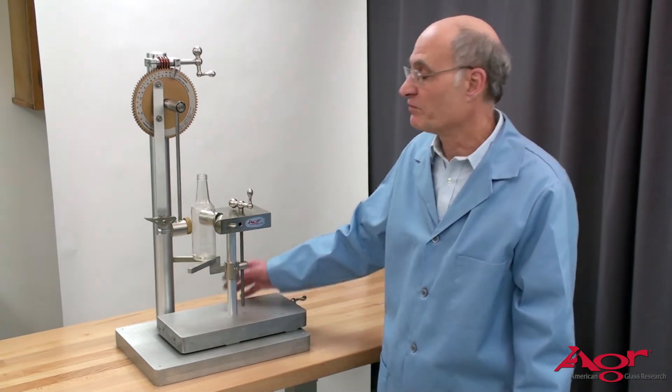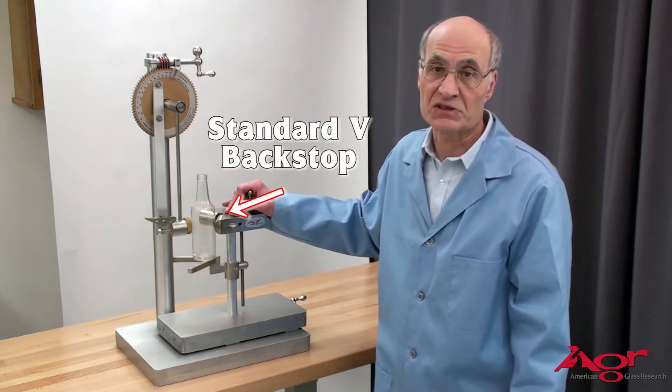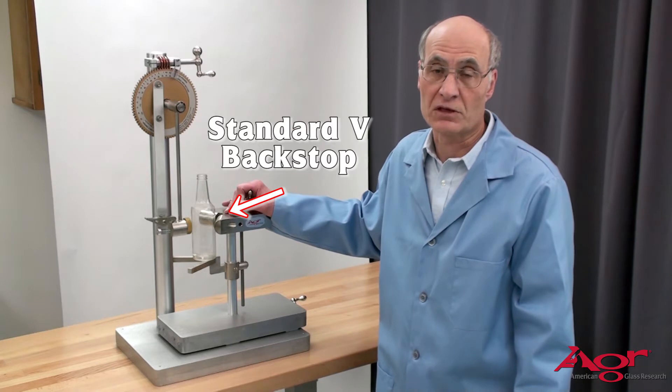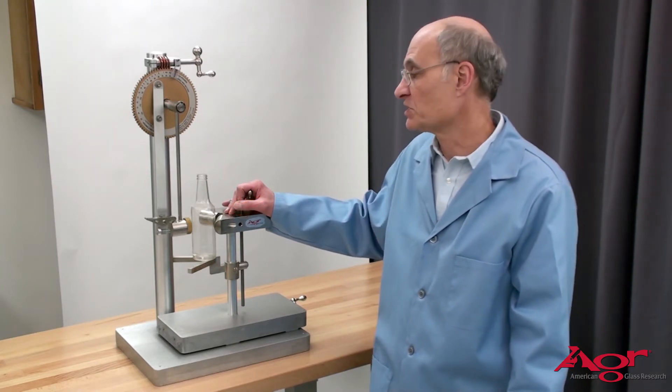The first thing is the type of backstop. For a lot of testing today we will use a V-backstop because it works well with brown bottles. It automatically centers the bottle so you don't have to worry about position so much.